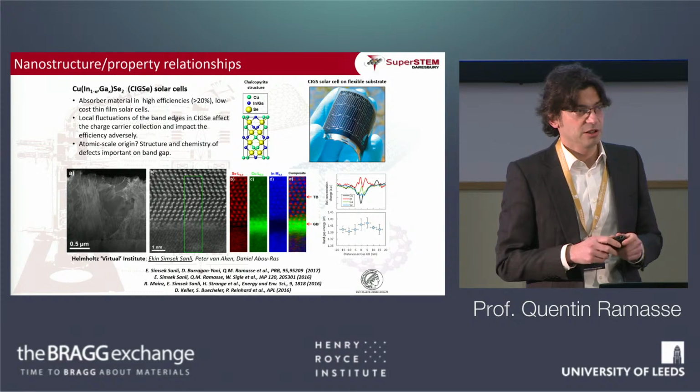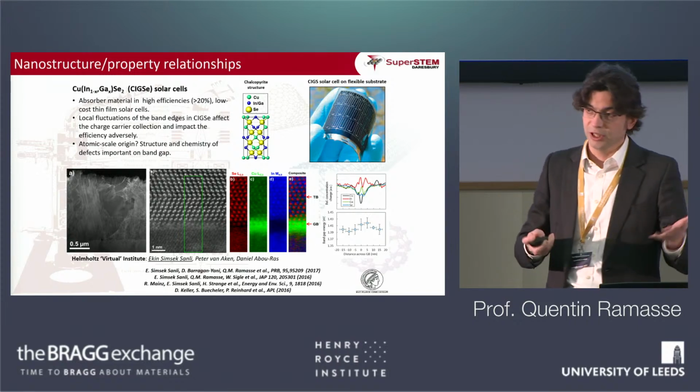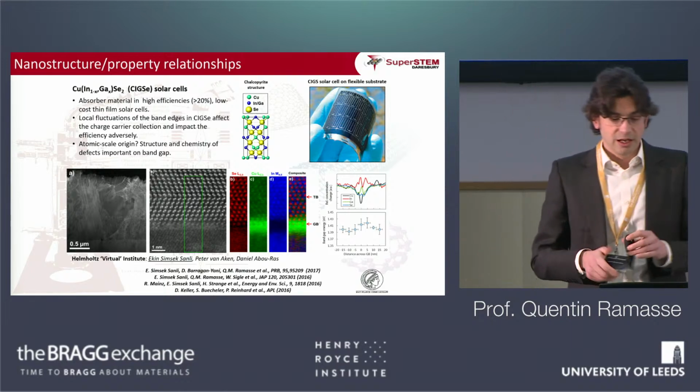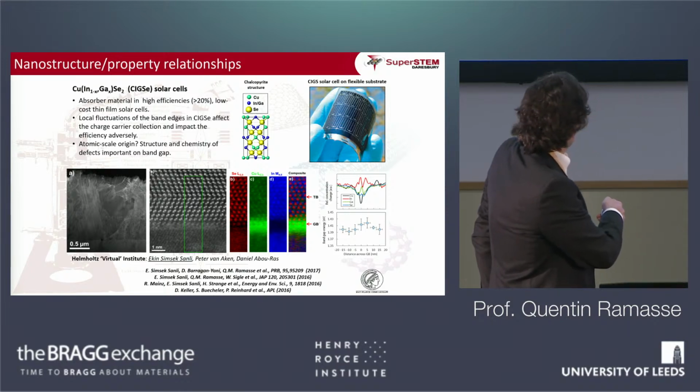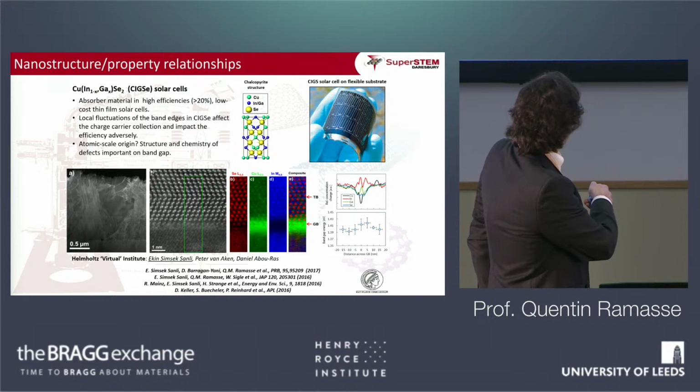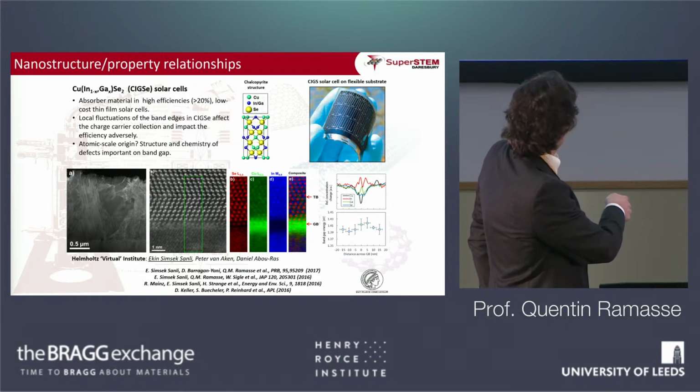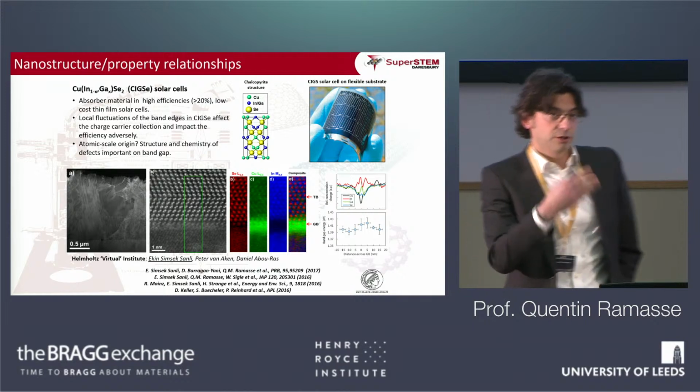Microscopy is always about symmetry interrupted, so what we like are defects, single atoms, line defects, 1D defects, and realizing that in this particular case, a stacking fault that you see here has no real change in chemistry, just a change in the orientation in the dumbbell in the crystalline structure, whereas that random grain boundary here has a lot more copper segregated to it.